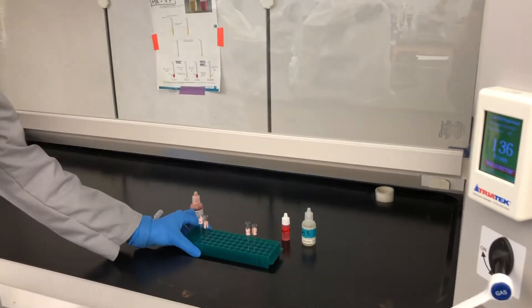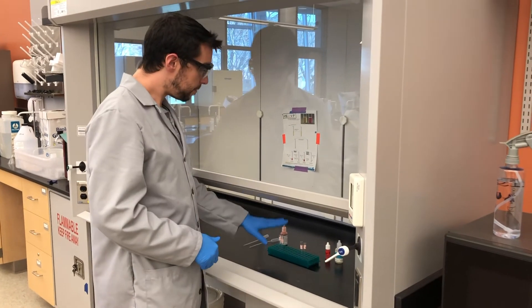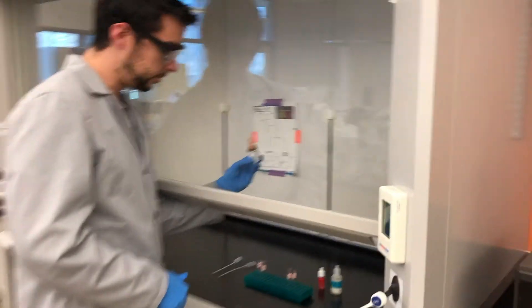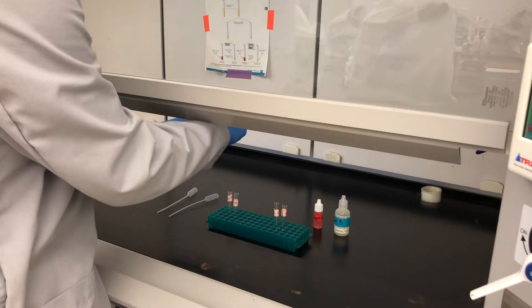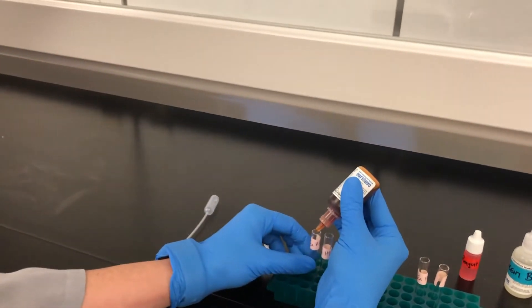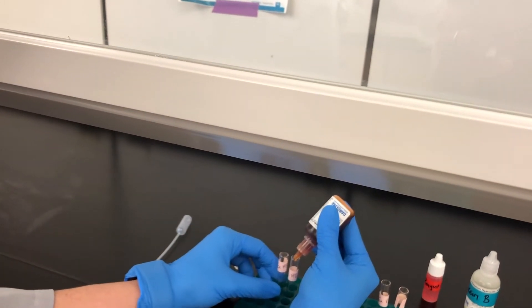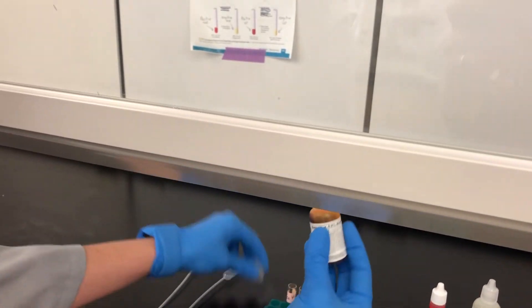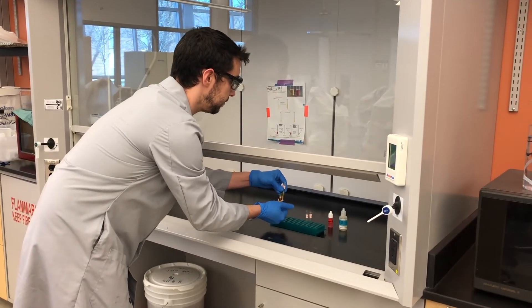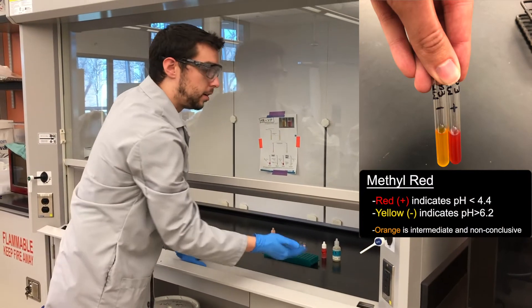Only one student can perform these tests at a given time, so be patient and take turns. For the methyl red test, it is fairly simple: grab your methyl red droplet bottle, decap it, and add three drops to both tubes. That is all you need for this test — it will show up immediately. Give them a flick to mix, and the results should appear as shown on screen.